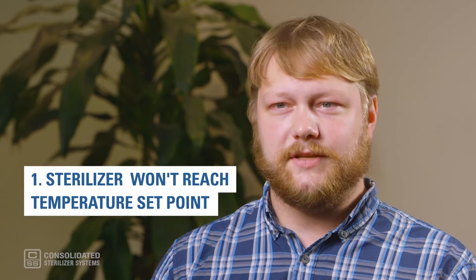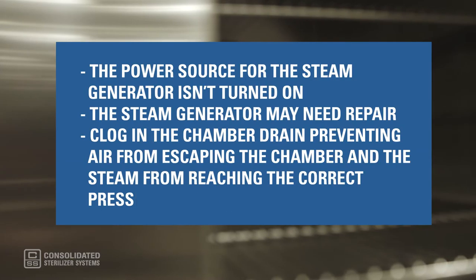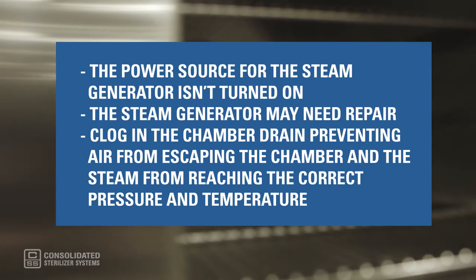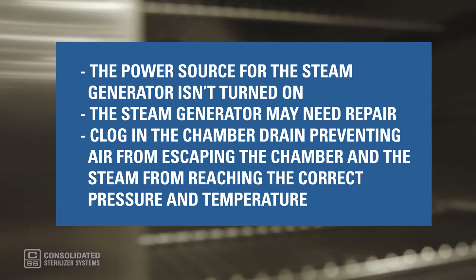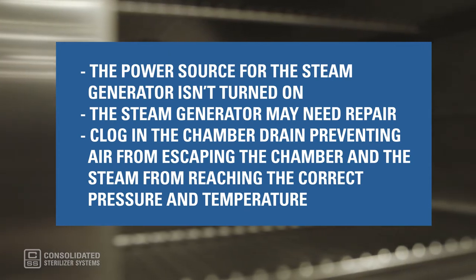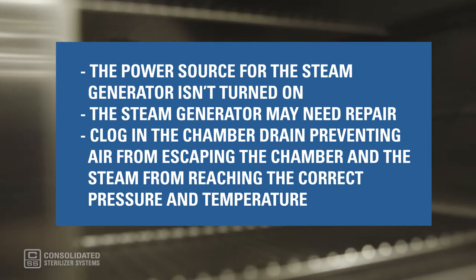Problem number one: the sterilizer won't reach the temperature set point. There are a few reasons why this might happen. Perhaps the power source for the steam generator isn't turned on, or the steam generator may need repair. Another option is that there's a clog in the chamber drain preventing air from escaping the chamber and the steam from reaching the correct pressure and temperature. Or the temperature the user has entered exceeds the autoclave's maximum temperature allowance.